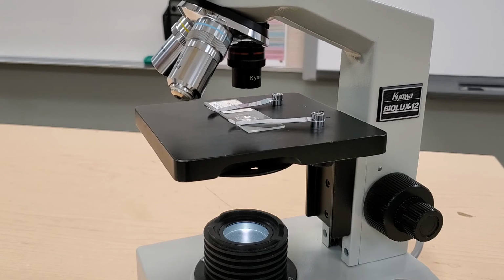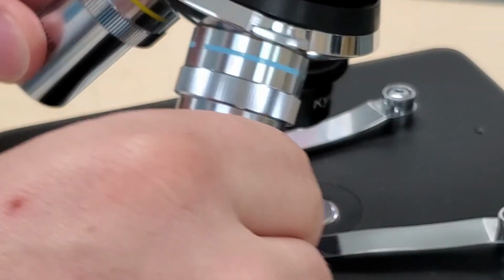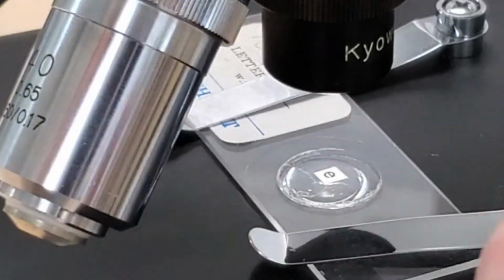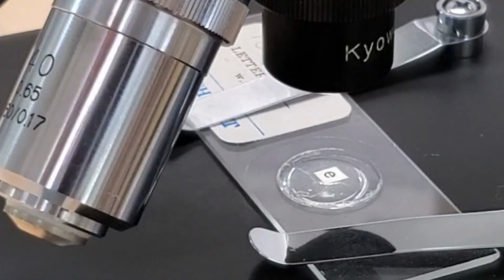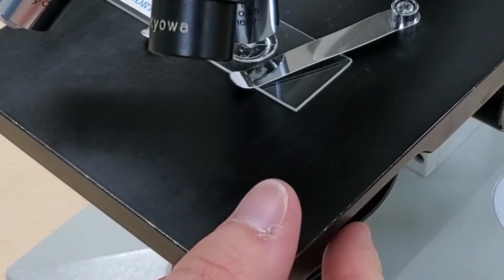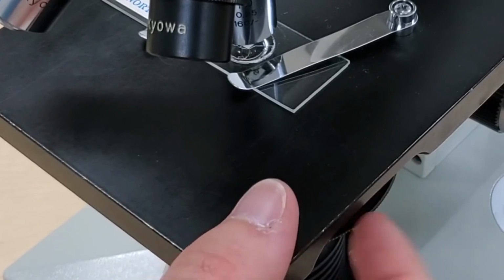I don't know if you noticed, but when we put our letter E on the stage, we put it the correct side up. It was in a readable position. But when we look at it through our eyepiece, it appears like it's upside down. More on this later.